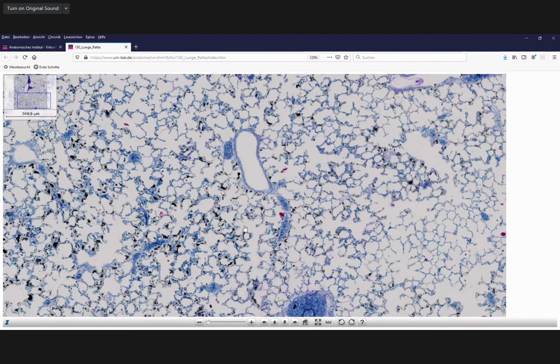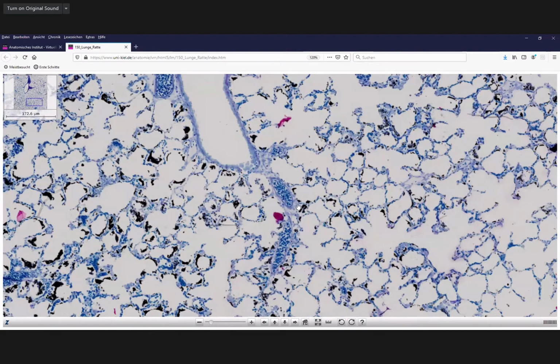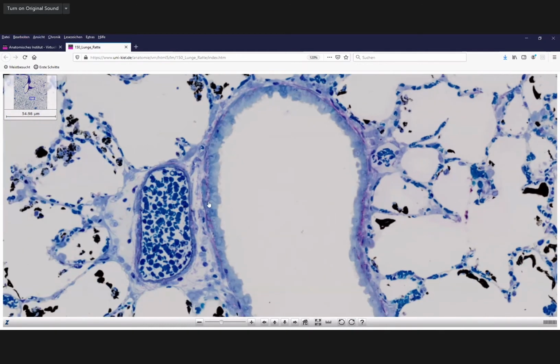So when we go one more time here into this larger lumen, which probably is some bronchiole, some late bronchiole, then you can see the club cells here bulging forward. Look at this. You have a simple epithelium, and here are the club cells bulging forward, and here another one, here another one, here and here. So there are now these club cells. So this is a bronchiole with a cuboidal epithelium. Here is a big blood vessel with lots of red blood cells.